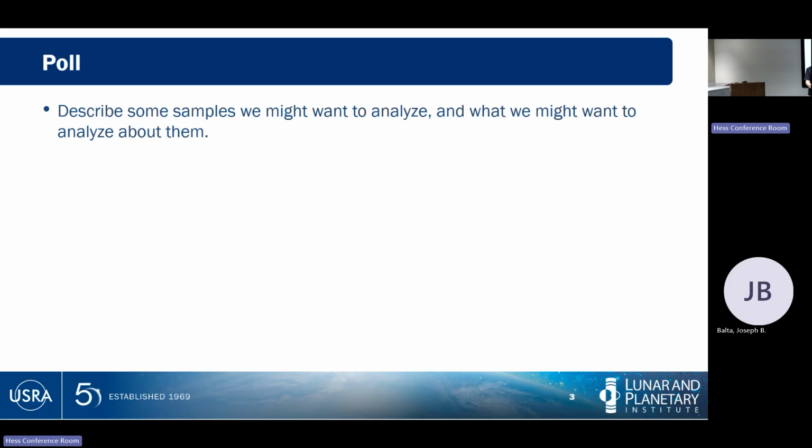Can we do a composition on organic matter? Well, the answer is going to be no. We can't really do that. That's actually a fundamental limitation of pretty much every SEM. We'll talk about that more tomorrow in the EDS session, okay? Because we're just doing sample prep focus right here.